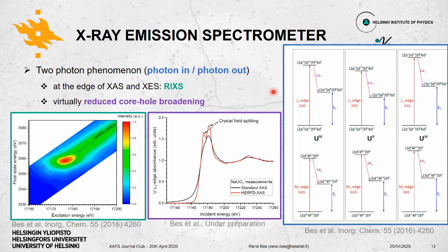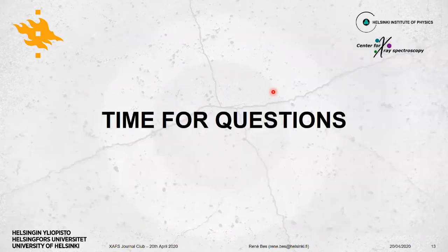It's the L-alpha 1 line, and actually we are close to, because it's the final state energy, and the final state, we have a hole in the M. Okay, I was misled by the final state energy. Okay, all right, Rene, you should continue for the next part of the talk.